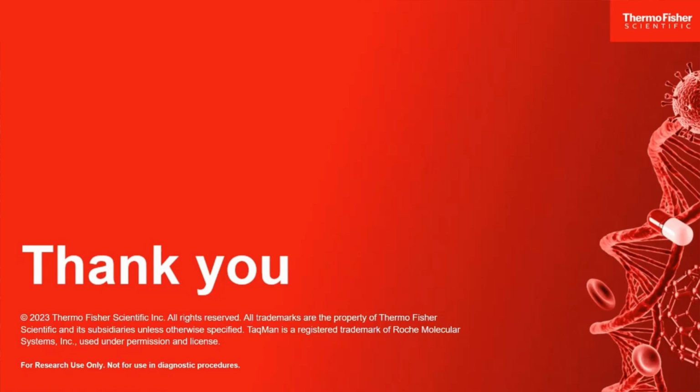If I perform a custom dye calibration, how do I know if it worked?